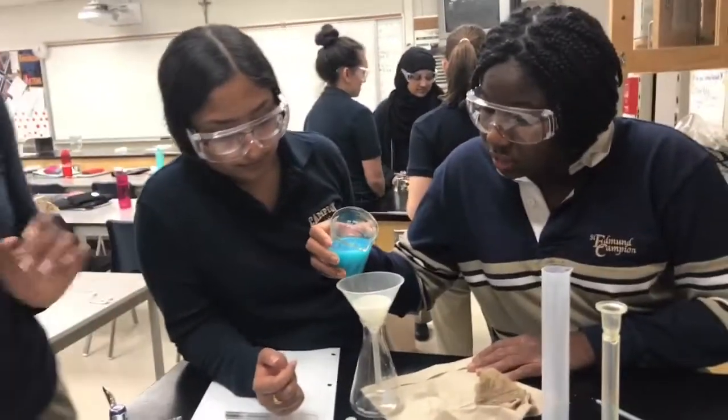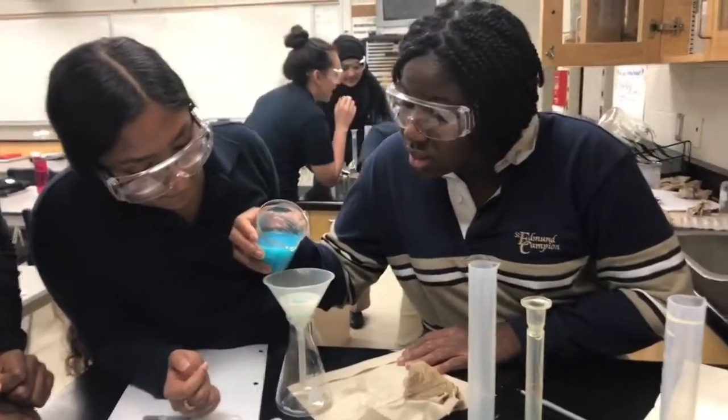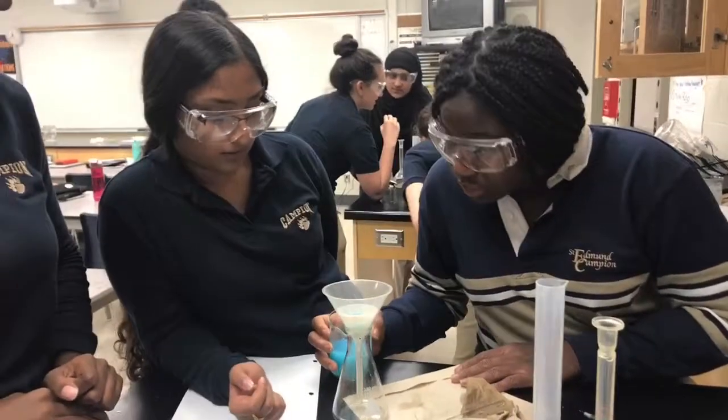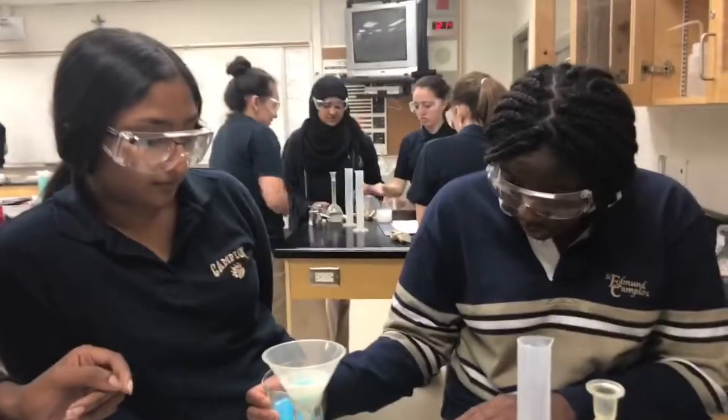Don't we need more water on this side? Should we stir it? Just pour. Just make sure it doesn't go over. Take it slow and steady. This is very slow, so we're going to be doing intervals of pouring and waiting. Well, we have intervals of stirring and waiting.